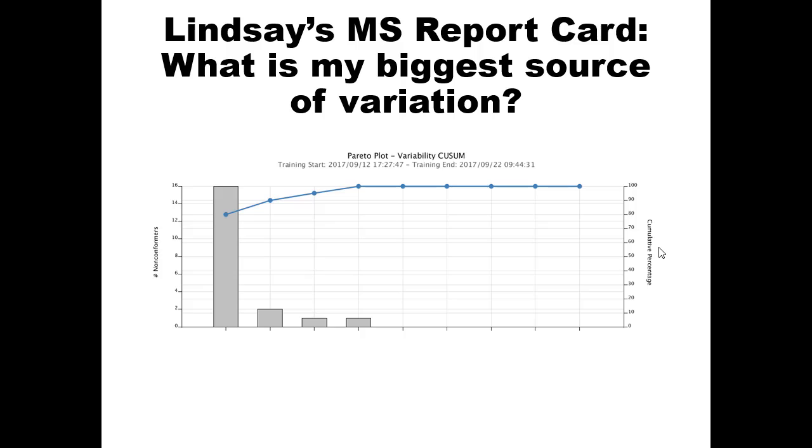The variance represented in this set of dates is normal for me, so I want to compare all my data to this set of dates right here. So this is showing for one of those guide sets that I said this is normal for me, this is representative of my performance that I always want to have on my instrument. So you see there's one extremely high source of variance and pretty much nothing else contributes to the variance in my data.